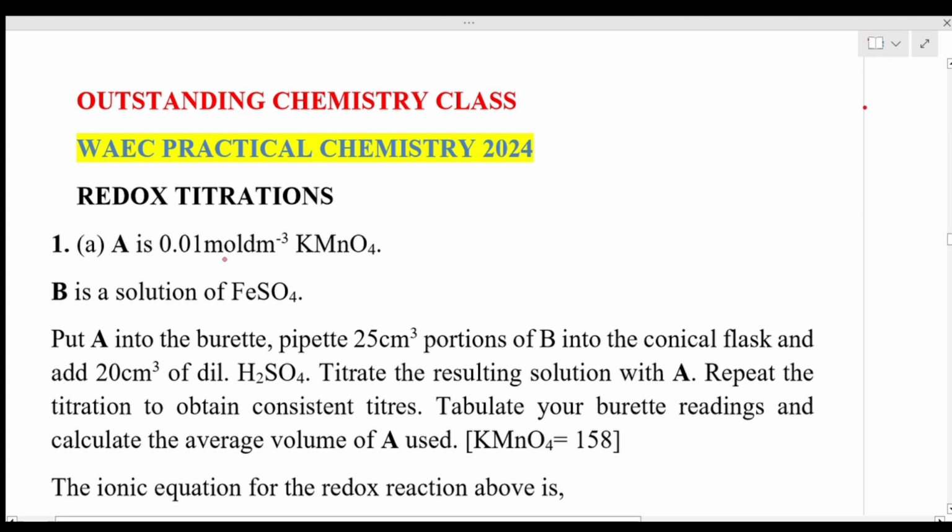Now we have three questions: question 1, question 2, and question 3. Question 1 comprises of titration. Question 2 comprises of salt analysis, while question 3 is a general question. So let's quickly start with WAEC Practical Chemistry 2024. Let's start with the Redox titration.